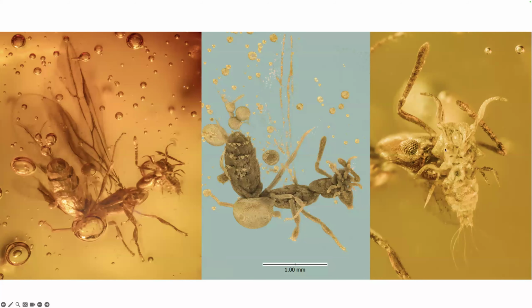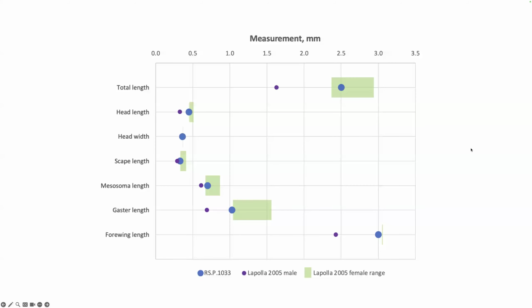this Acropyga ant. And so what's the story? And this is one of the things when you're being curiosity driven and just taking a look. So you think, I wonder what I'll see if I look at that in 3D. And in this case, you end up with the same story. It's very clearly one of these female ants that's carrying her mealybug, starting a new colony. But there's one thing that's quite special about the 3D view, which is that you can view it from any angle. And with the amber, you can't. The amber is generally flat, especially when it's been polished to come quite close to the inclusion.